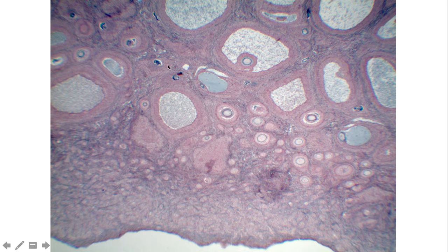As we look within the ovary itself, you'll see in this case dozens, maybe hundreds of different follicles, all at different stages of development. The four that you're looking for: primordial follicles, which tend to be the smallest and often are out here on the outer edge. Then we have primary follicles. These right here would represent some of the primary follicles. And then we're going to see some secondary follicles. These two right here are nice examples of secondary follicles. You can see this little space that's forming in there. And then finally, we have mature follicles, where that space is much more prominent than in the secondary.